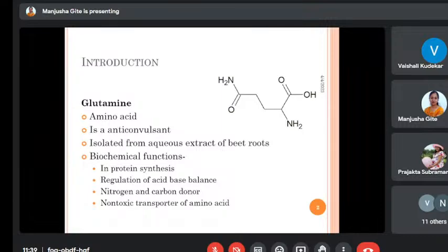In the beginning only I have told you. While posting your IR, you mention your structure. Below that, write one table: serial number, functional group, range, actual, and observed. What you observed, you write in the next column. Then we will state our conclusion.